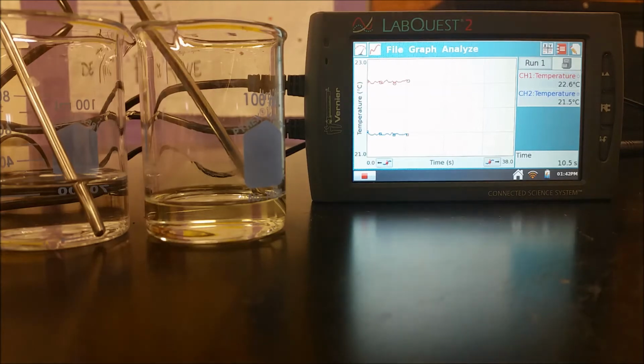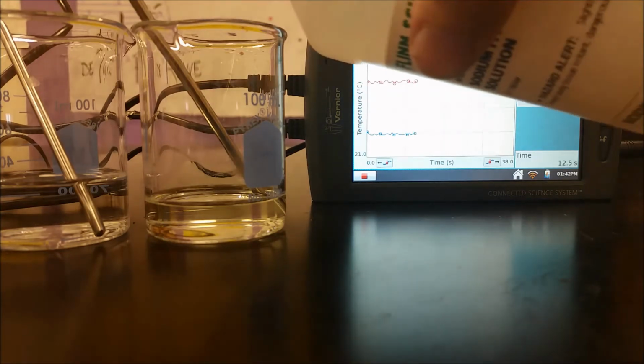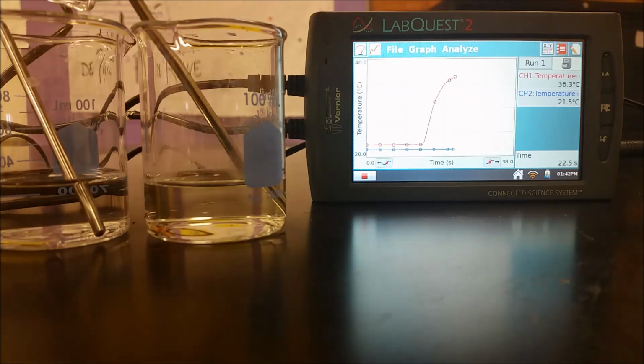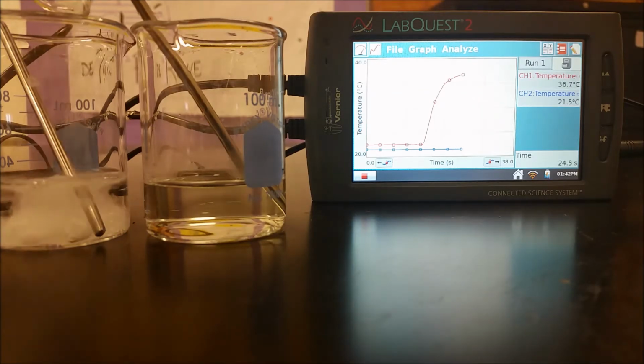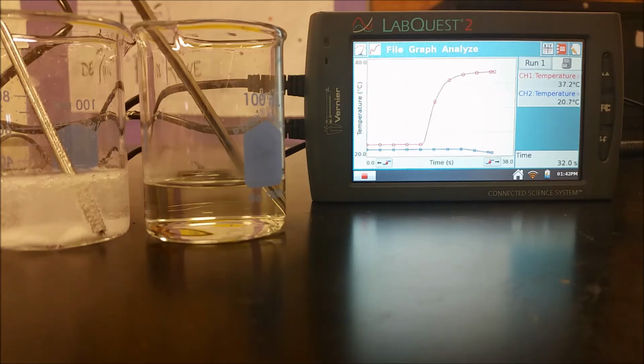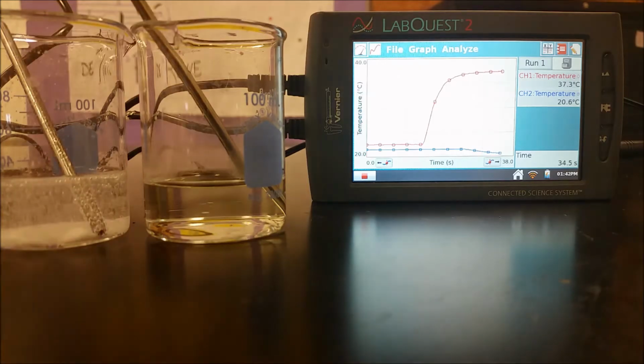Here we're going to pour some sodium hydroxide into nitric acid. When we do, it's going to increase in temperature quite a bit. And then the other one here, we have some vinegar. We're going to add a little bit of baking soda. You can see the CO2 gas coming out there. When we do that, we see the temperature actually start to go down, although not as much as the other.